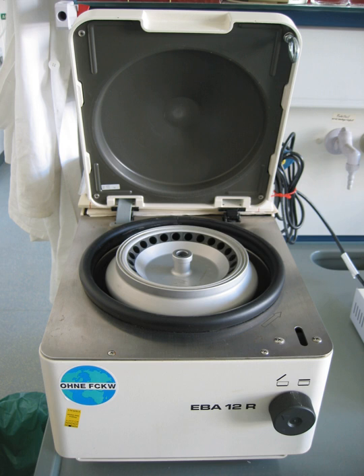Topic: Safety. The load in a laboratory centrifuge must be carefully balanced. This is achieved by using a combination of samples and balance tubes which all have the same weight, or by using various balancing patterns without balance tubes. Small differences in mass of the load can result in a large force imbalance when the rotor is at high speed. This force imbalance strains the spindle and may result in damage to the centrifuge or personal injury.